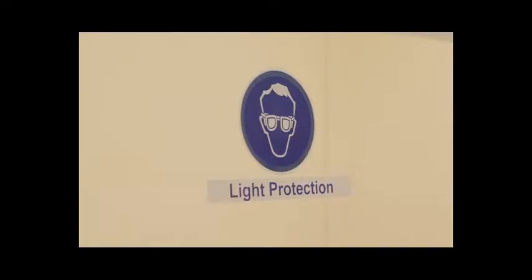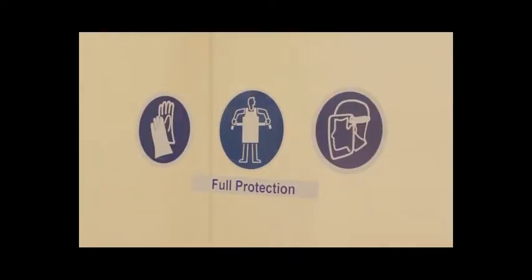When handling chemicals you are required to use personal protective equipment. We have two levels of protection, light and full.